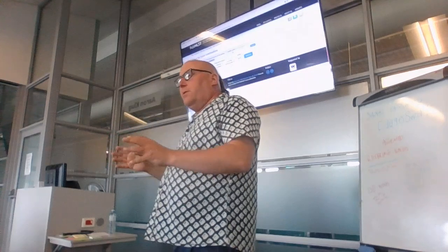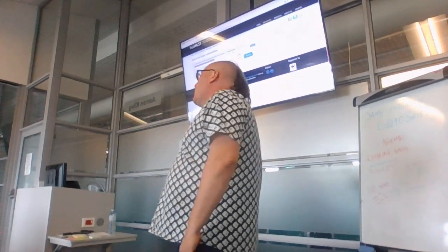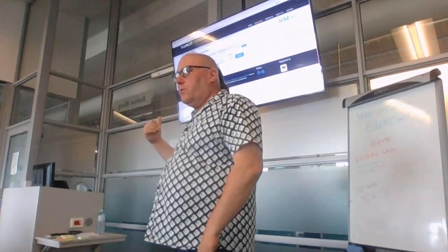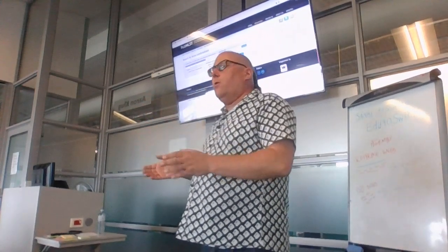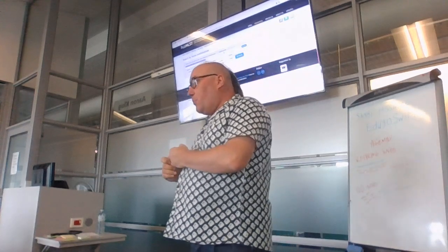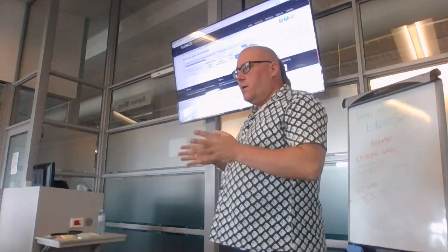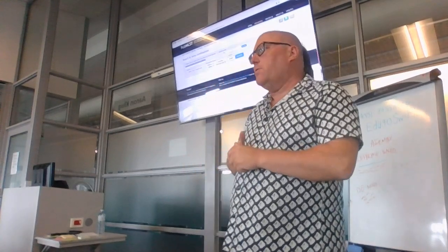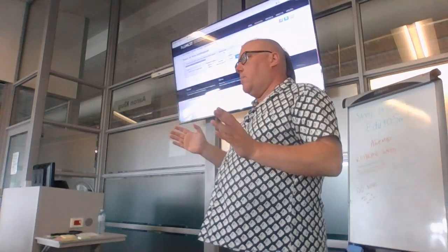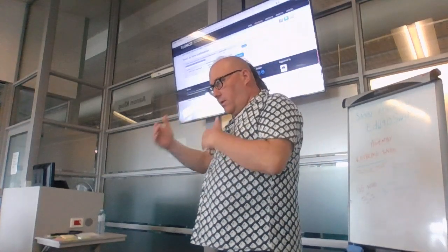And that will allow us to identify, but you see there are only 4 genes here, so the identification is fairly broad. The cgMLST for Vibrio cholerae has, I think, about 2,000 alleles, so then you can get much closer. For instance, the Listeria outbreak in South Africa in 2017-2018 was analyzed using cgMLST of Listeria isolates, okay? And that used a scheme with 1,700 different loci, so you looked at the allelic pattern at those 1,700 positions, and then you got a profile.